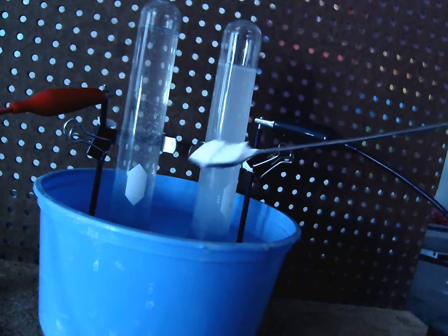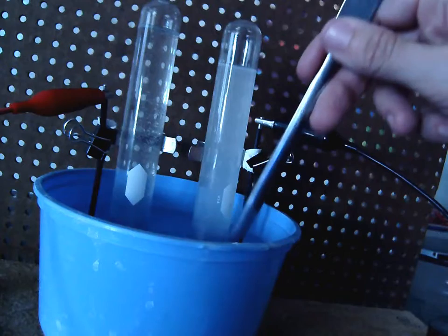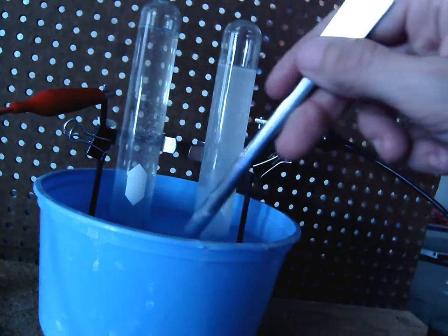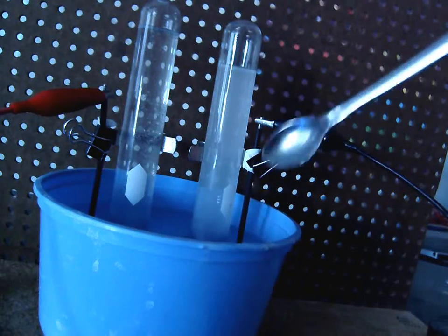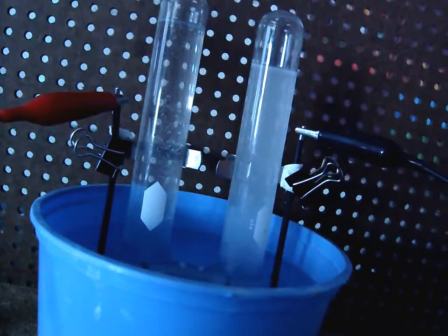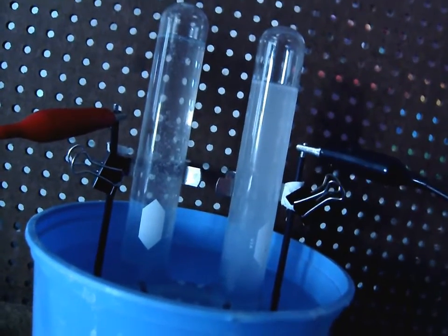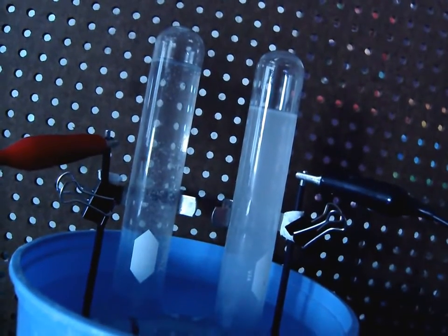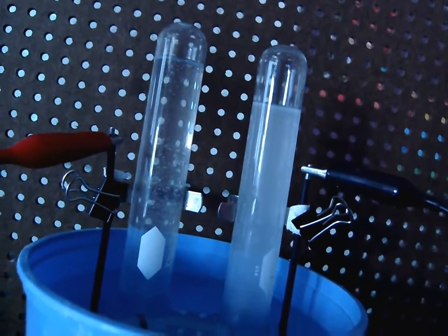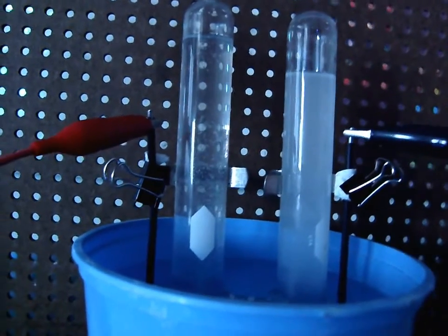We added a few scoops of baking soda to the water. So it's important for you to understand the purpose of the baking soda. The baking soda has absolutely nothing to do with the outcome of the lab. We are still separating water into hydrogen and oxygen. And the end result and the ratios that we come up with will be the same no matter what. So the purpose of the baking soda then is just to make this reaction go a little bit faster.